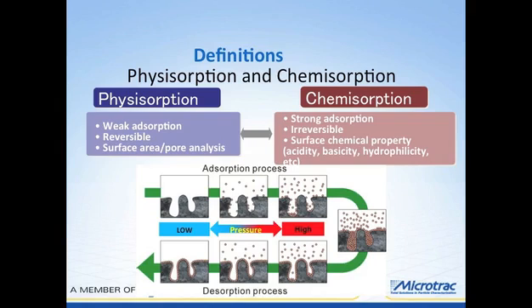Now, the whole process that we're really talking about, if we look at the diagram below, the adsorption process, if we start over here, under these conditions we have a very low concentration of the adsorbing molecules, and at this point no adsorption is occurring. But as we change the concentration of that adsorbing gas, or in other words, we're increasing the pressure of that gas associated with the material, molecules of the gas start to attach themselves to the surface in the pores and on the surface of the particle.